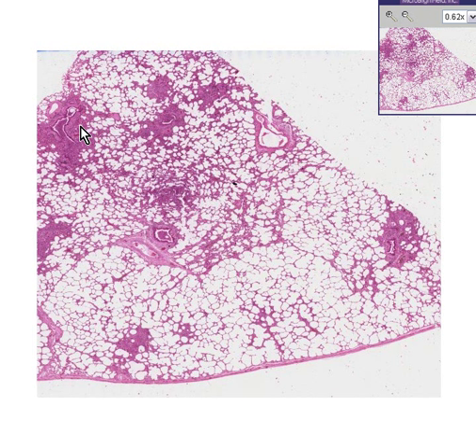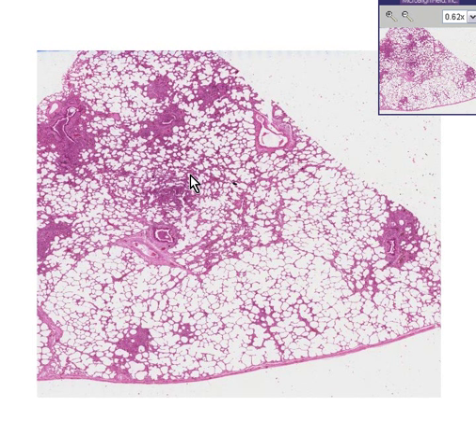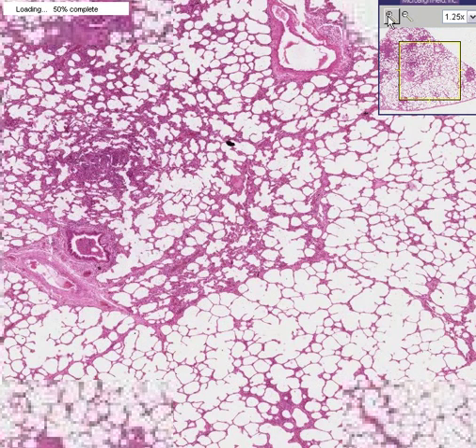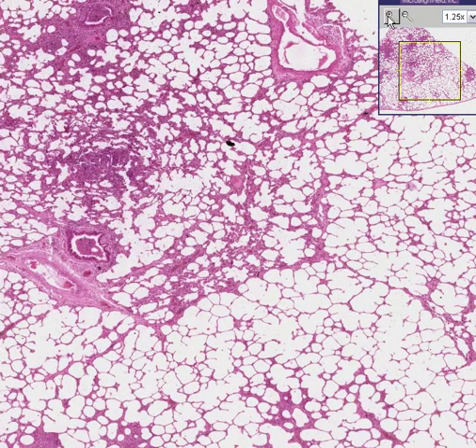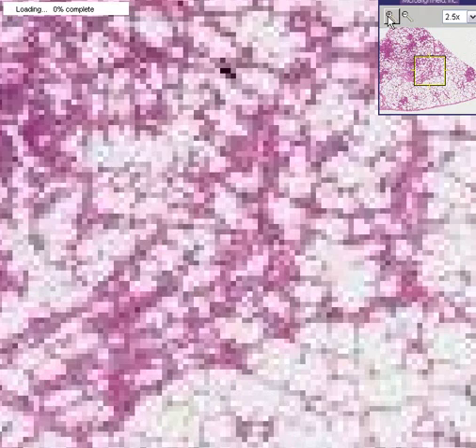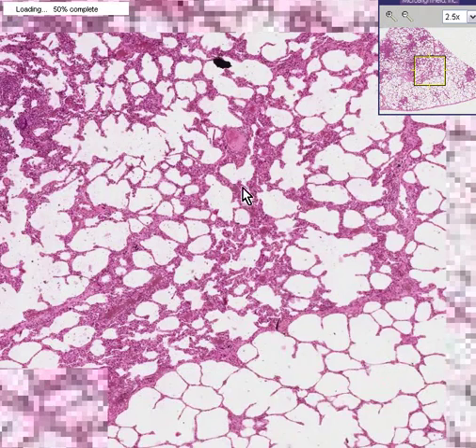In an instance where a whole lobe of the lung would become consolidated rather than just an area around a bronchus, that would be called lobar pneumonia. But this case is called bronchopneumonia.